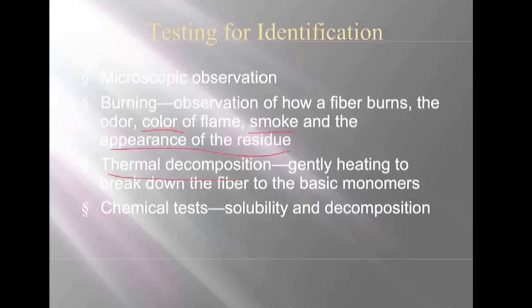Thermal decomp. This is when you basically kind of melt the fabric or the fiber, whatever it is. You try to melt it down to its basic components and back to the monomers. And if you remember anything about chemistry, specifically organic chemistry, talking about macromolecules, you know that mono means one, and mer means part. So these are the basic building blocks of whatever particle it is.